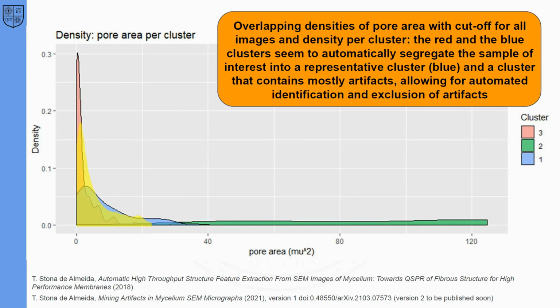It is visible that the clustering can help further sanitize the data. Splitting the manual selection into a cluster that contains very small pores and most of the remaining artifacts, while the medium-sized pore cluster is mostly composed of actual pores and few artifacts. Summarizing these results, which focused on artifacts of only one micrograph, but feature benchmark estimated for the whole set of images at same scale and depths.